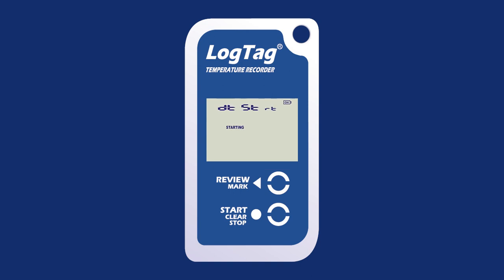If the logger is configured for an automatic date and time start, 'Starting' along with 'DTS-TRT' will display, and the logger will start recording temperature values as soon as the entered start time is reached. If the logger is configured for a push-button start with a start delay, 'Starting' will display on the screen along with the delay time shown in hours and minutes. Finally, if the logger is configured to start when the Start Clear Stop button is pressed, 'Ready' will display along with the current time.